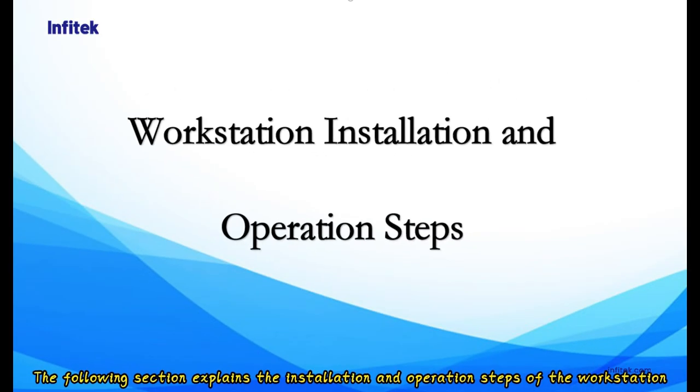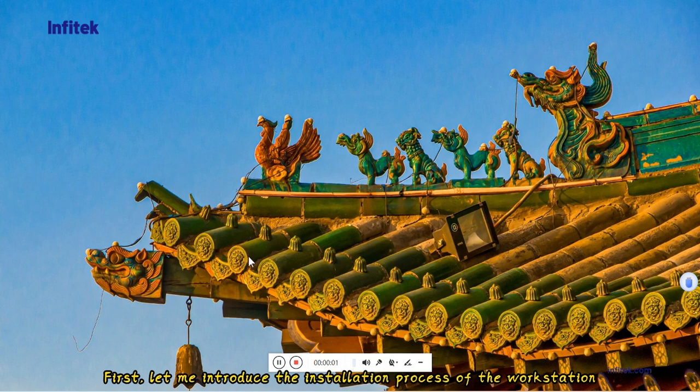Hello everyone. The following section explains the installation and operation steps of the workstation. First, let me introduce the installation process of the workstation.